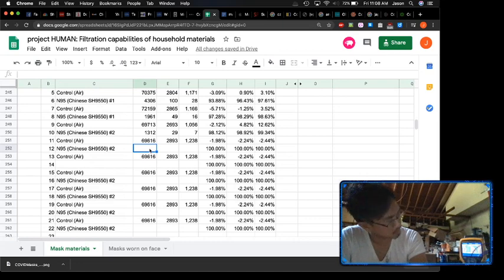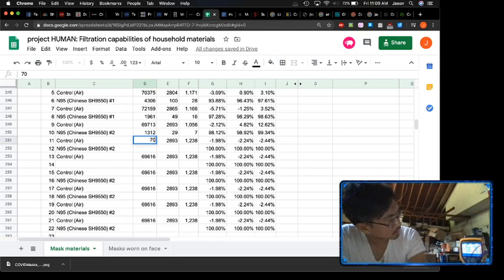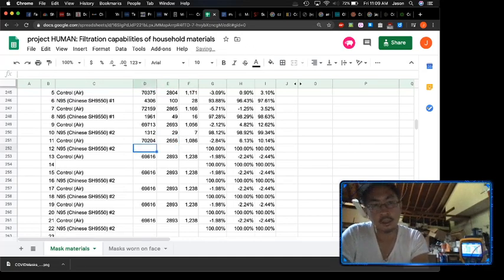Probably don't have to pull 2 liters of air. Okay, new control. 70,204. 2656. 1086. Alright.